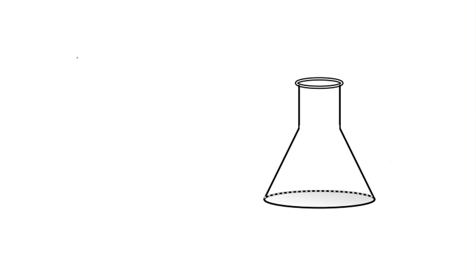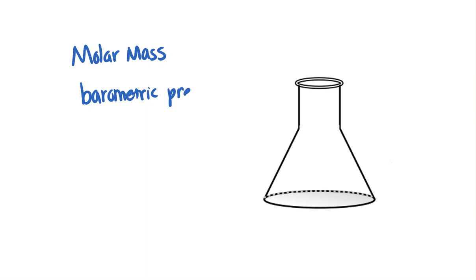So are you ready to do the molar mass experiment? Before we get started, there are a few things you need to note. One is that the barometric pressure will be data A that your instructor gave you, and that is in millimeters of mercury.